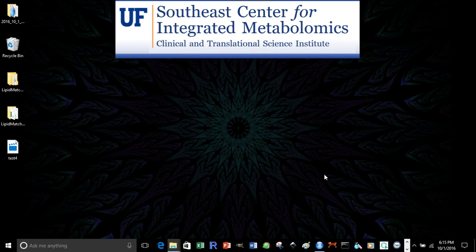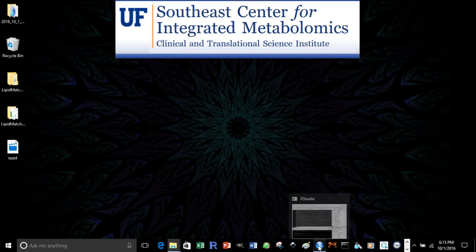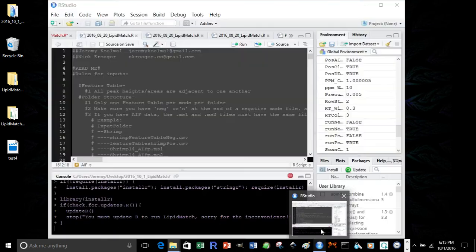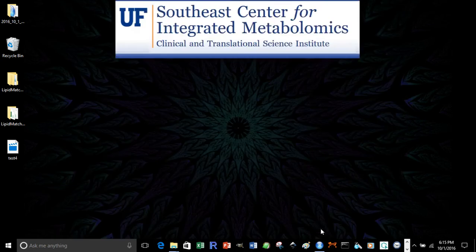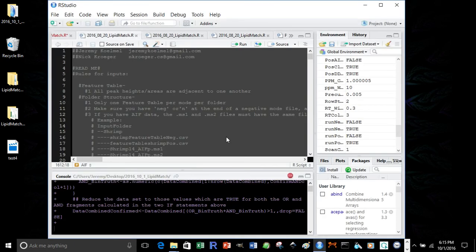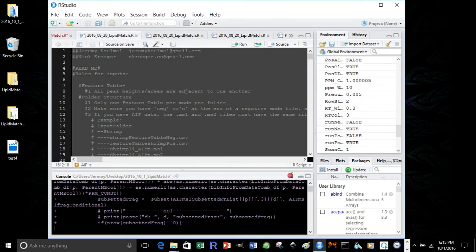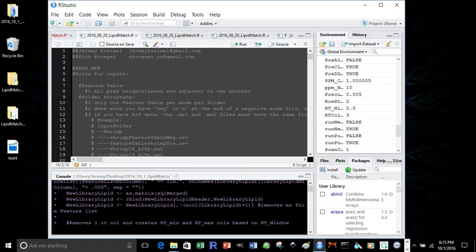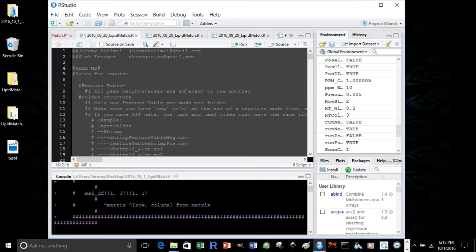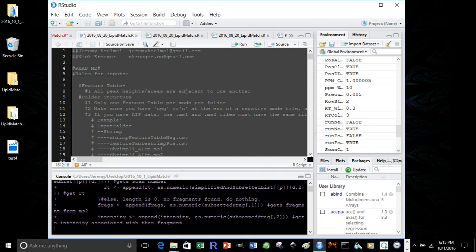To know that your code is running, you can open up RStudio, un-minimize it. And you'll see the stop sign. Don't click it. The stop sign will appear and disappear as the code goes on. And once it disappears and doesn't come back, that means the code is finished. It will also print, which I'll show you later, which step has been completed.